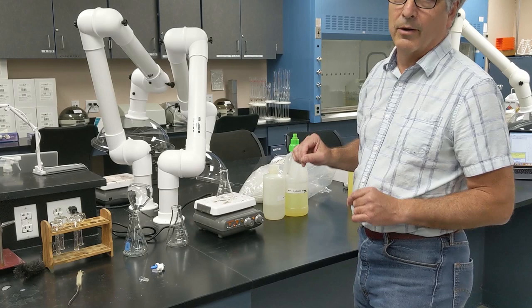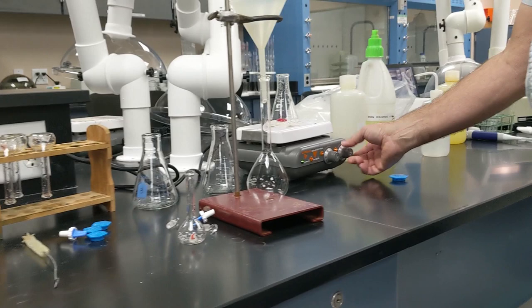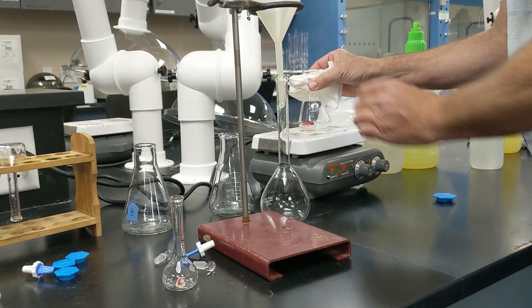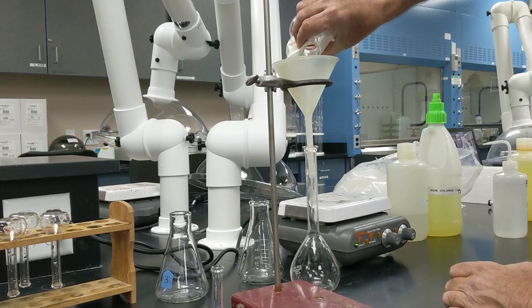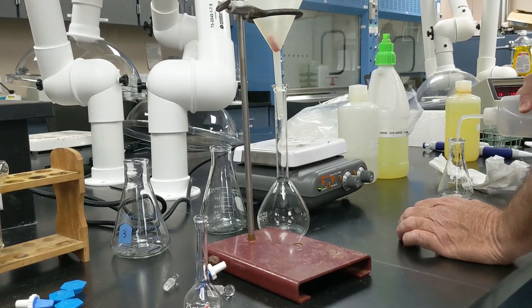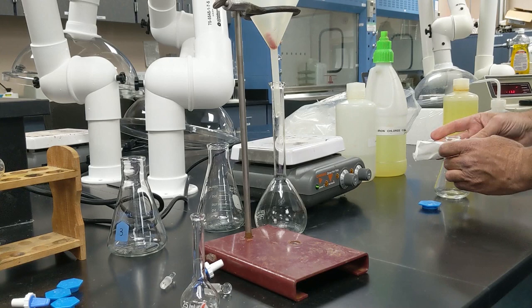So now we're going to do the last step of the preparation. So I'm going to turn off the heat. And this is our solution that has the ground up aspirin with the sodium hydroxide. Okay. And I'm going to transfer it into this 250 ml flask. Okay, now there might be a little bit of solution that didn't get transferred, so I'm going to rinse the Erlenmeyer flask out a couple of times and combine that.